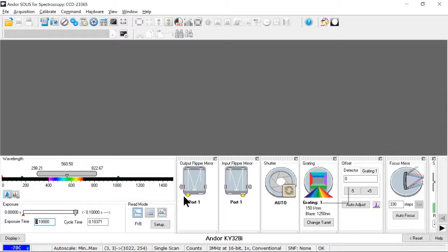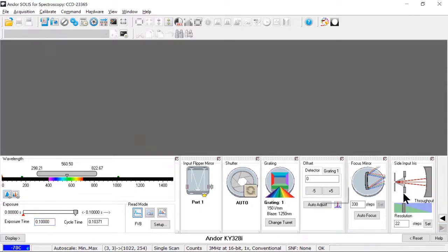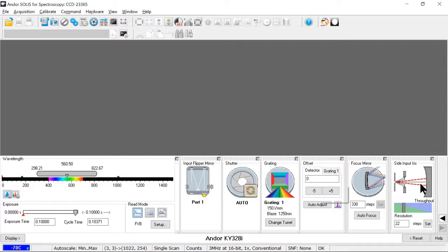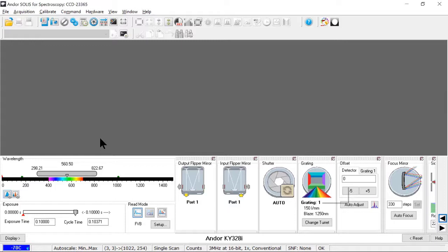I can also control all the other motorized components on the spectrometer. The output flipper mirror, the input flipper mirror, shutter, grating, focus mirror, and TrueRes iris over here. And if I had motorized slits of any sort, those would also show up in this. But I have manual slits on this model here, so I'm going to set those manually. I can control all of these things via the GUI, including exposure, wavelength, and accessories, and so on. Or I can quickly write programs in Andor BASIC, our built-in scripting language.